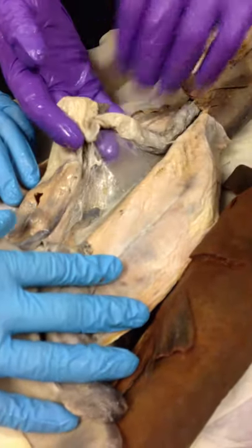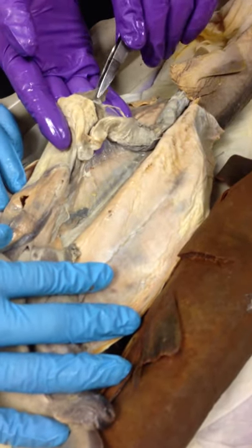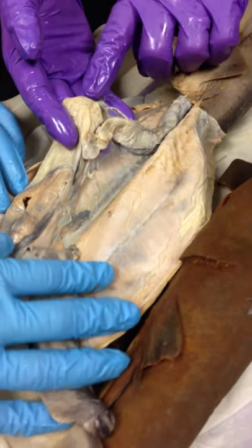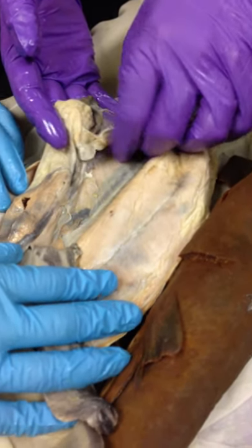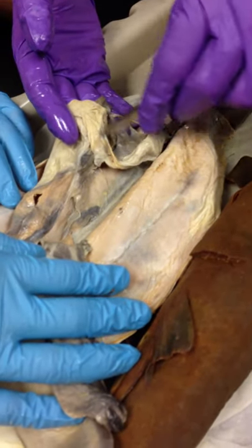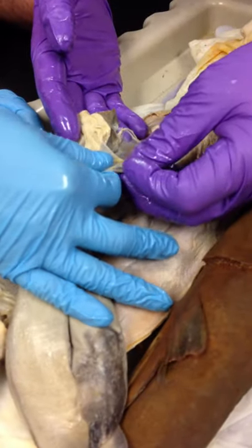This is a shark. Watching, the stomach comes down here and then makes a U-turn. Right at the end of the U-turn, we have the spleen, which is the same thing that we see in humans, but it's in a different spot, of course. It does red blood cell recycling. And then we have this part from this loop over to this loop. This is the duodenum. So we can kind of hold it like that.